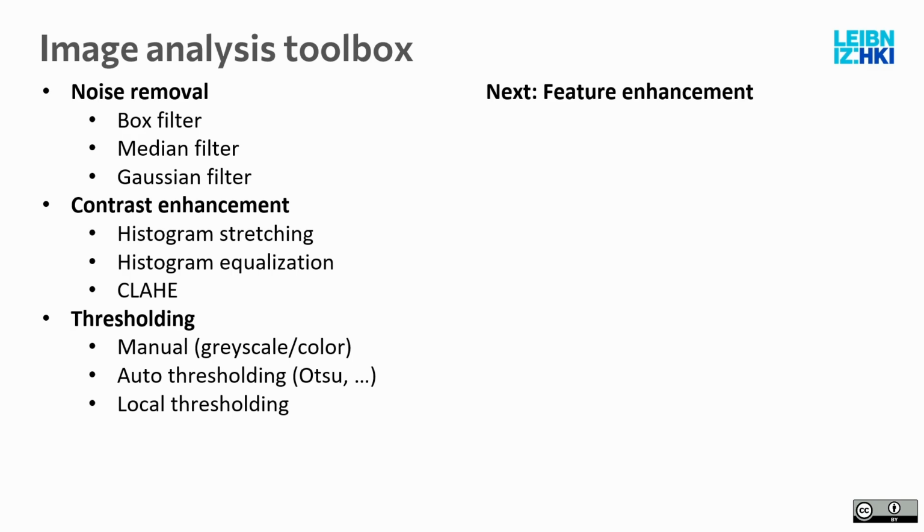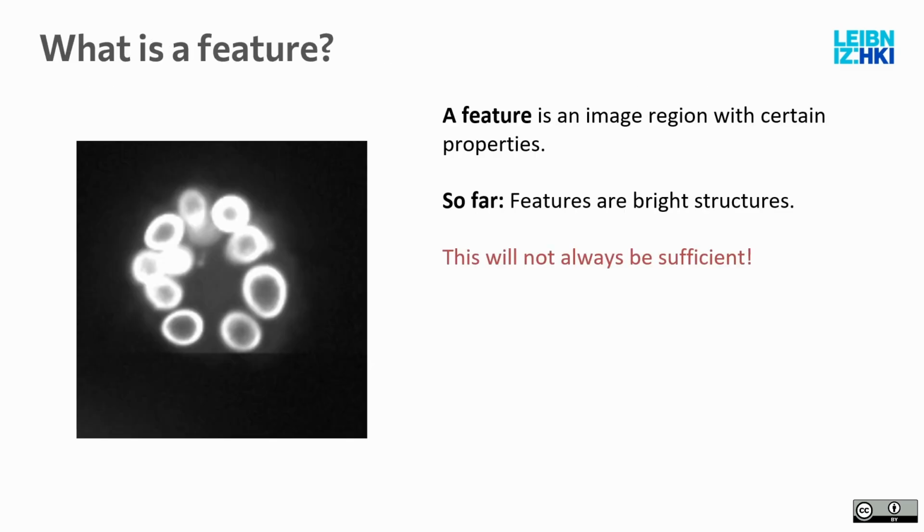This one I can quickly do. Let's talk about feature enhancement a bit. So what is a feature? You have here an image, again these clusters that I always use. And a feature is basically a region that has some kind of properties that are of interest.